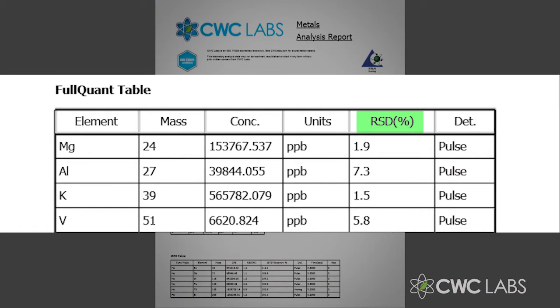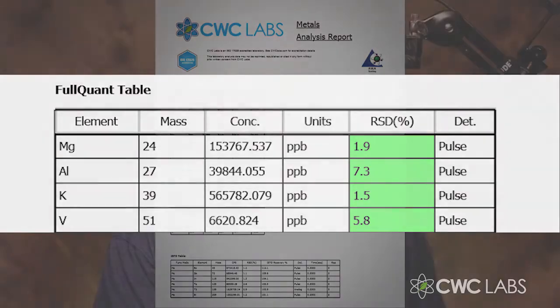of heavy metals. Now, the next column is RSD percentage. RSD means relative standard deviation. For the most part, you can ignore this column. But you should know that the smaller the number, the more accurate the concentration reporting result is, because it means we had more data in which to gather the concentration numbers.